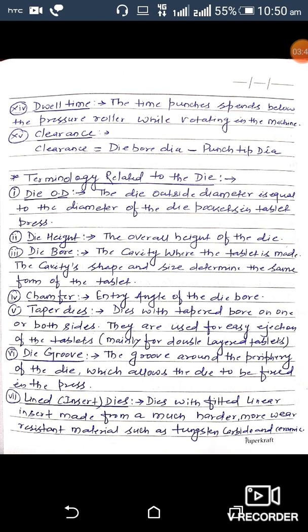Now, terminology related to the dies. One tool set includes upper punch, die, and lower punch. First terminology is die outer diameter: the die outside diameter equals the diameter of the die pockets in the tablet press. Second is die height: the overall height of the die. Third is die bore: the cavity where the tablet is made — the cavity shape and size determines the form of the tablets. Fourth is camfer: the entry angle of the die bore.